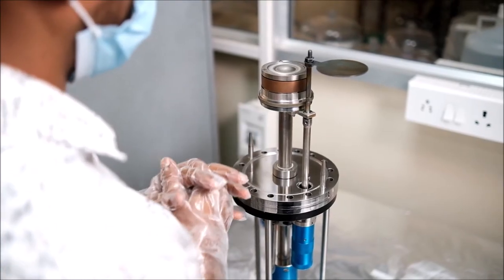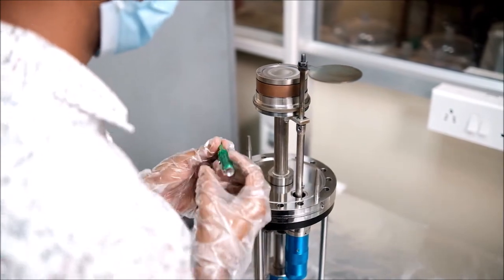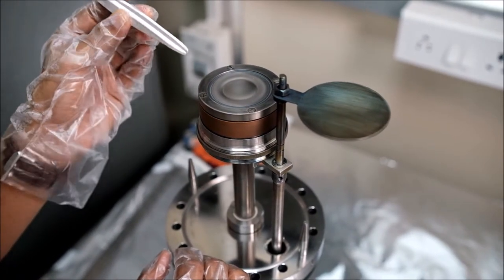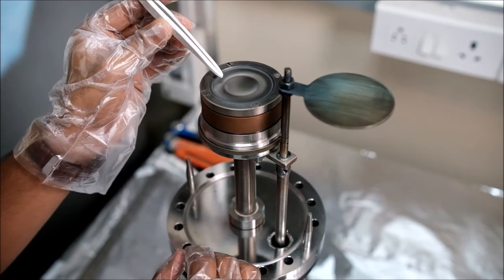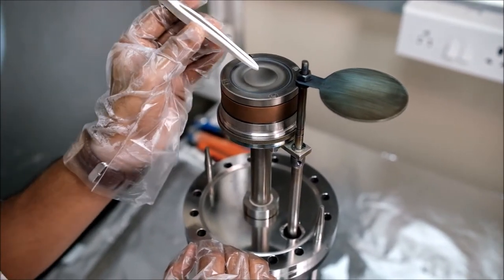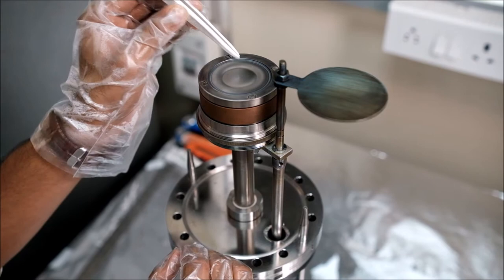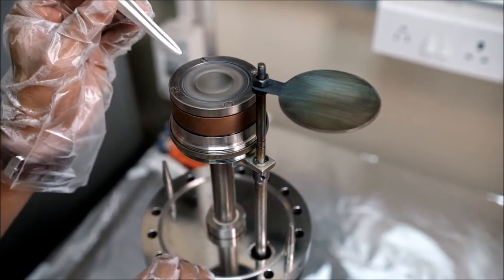Now we have connected the target material onto the cathode part. We see that this tungsten target has been used for many depositions and there is a certain pattern on the target. At this part, we see a ring-like structure where most of the sputtering occurs. As I explained earlier about the magnetic field alignment, most of the argon ionization occurs at this area only, and that is why most of the sputtering occurred in this zone.